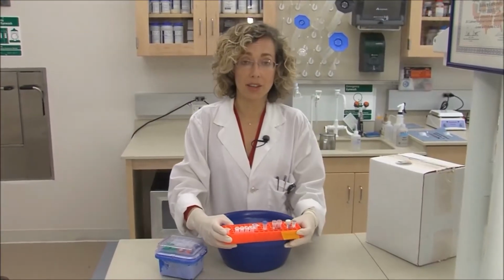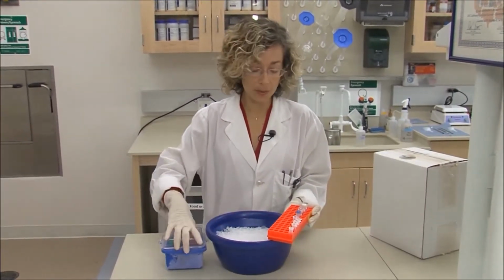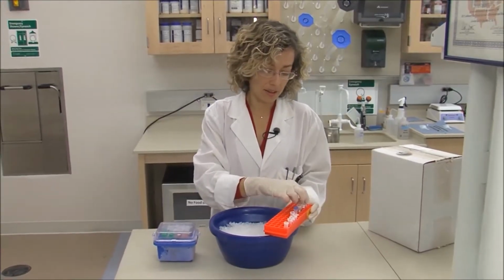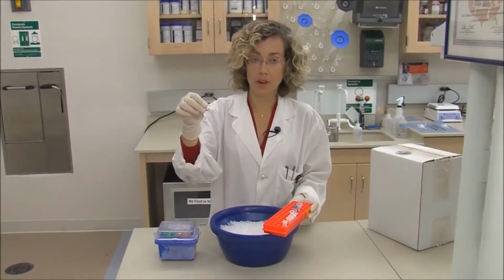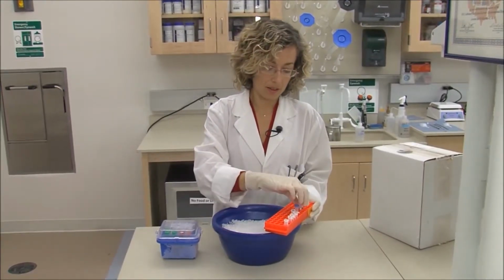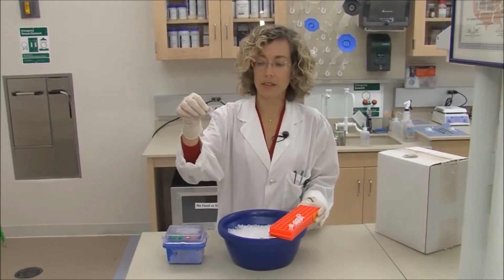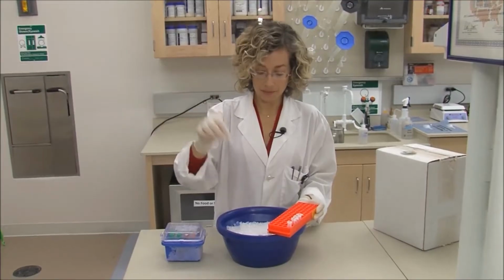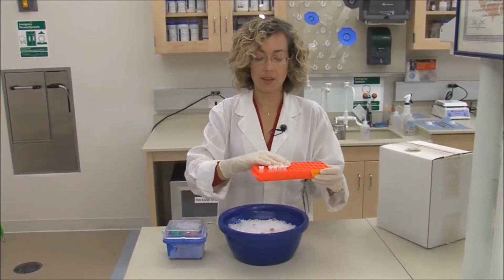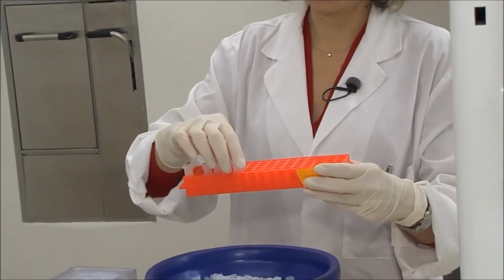So the reagents that you need to set up a PCR, we are gonna make our own master mix, is the Taq polymerase buffer, the magnesium chloride, your primers, the dNTPs, distilled water, and then today we are going to run 4 samples and we have our positive control.